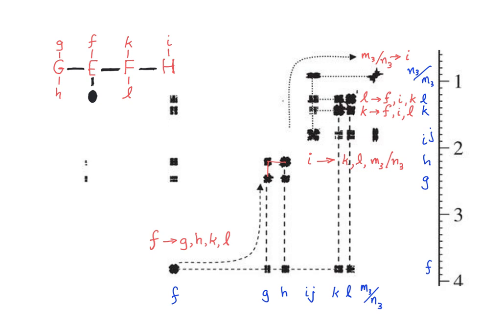Finally, with the correlation of proton I with the methyl groups M3 and N3, which we know are respectively bonded to carbons I and J, we complete one end of the compound, and we know that we are at a terminus because carbon can be bonded to no more than 4 other atoms.